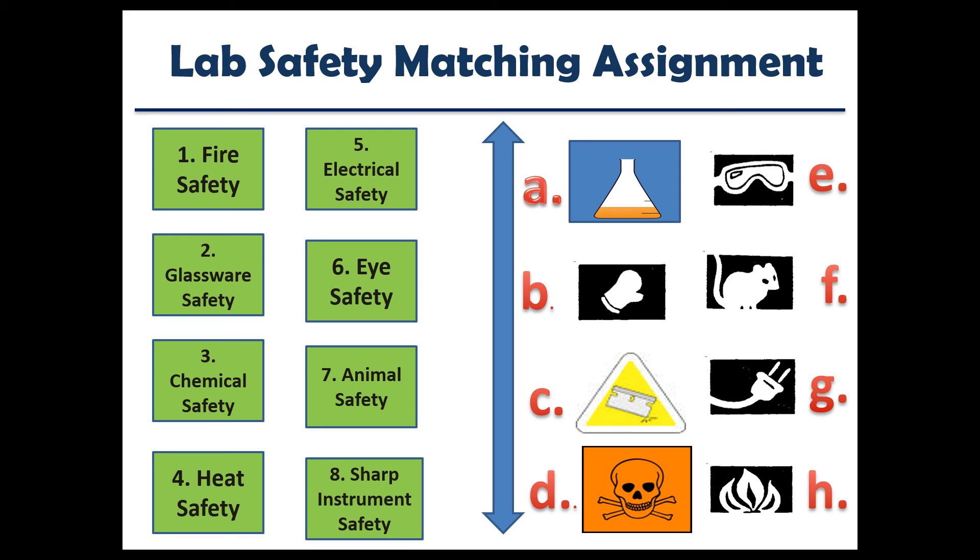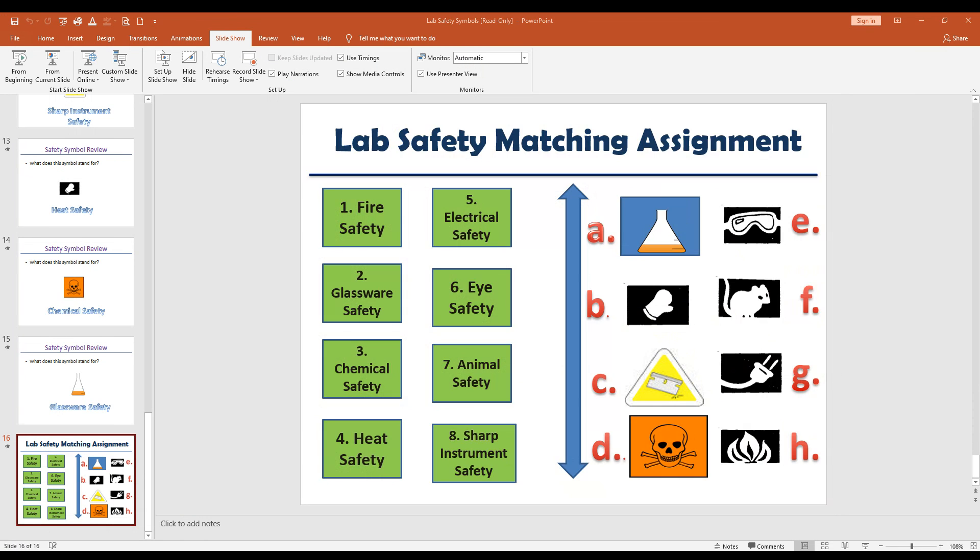The last thing we're going to do in today's lesson is a matching activity. On a sheet of paper, number one to eight and match the name of the safety symbol to its symbol. When you get finished, you are done for the day.